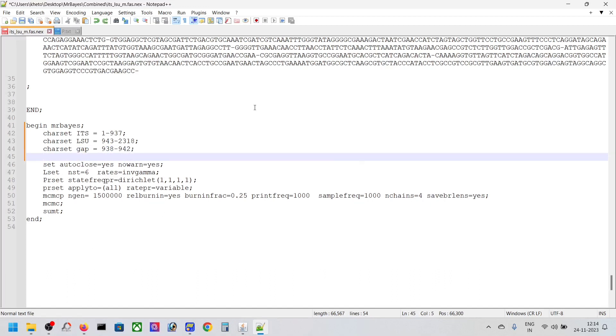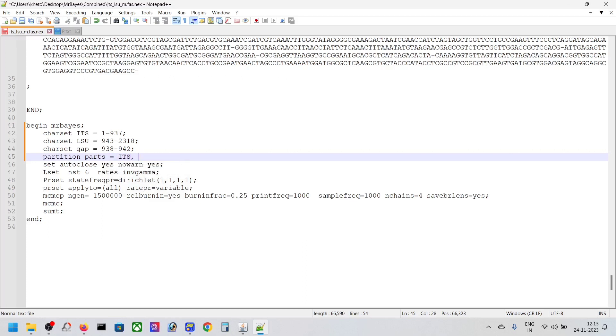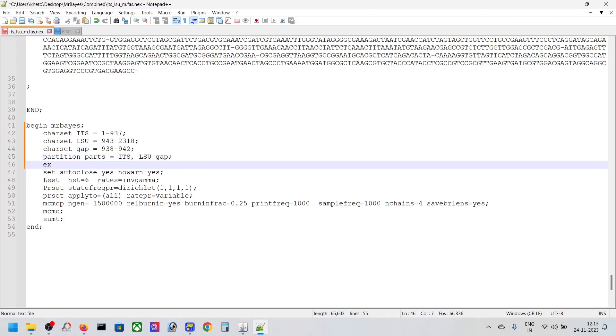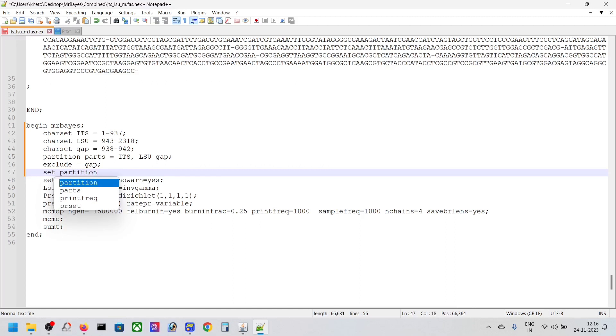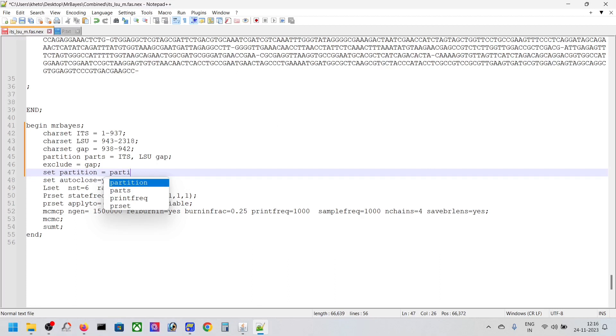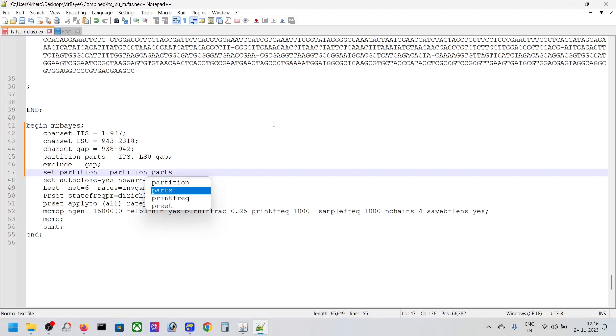Now we're going to make the partitions. It's P-A-R-T, partition equals ITS, LSU, and GAP. Just do this because we are not going to include the gap, that's why. Then set partition equals parts.